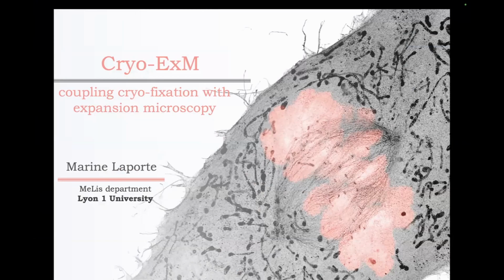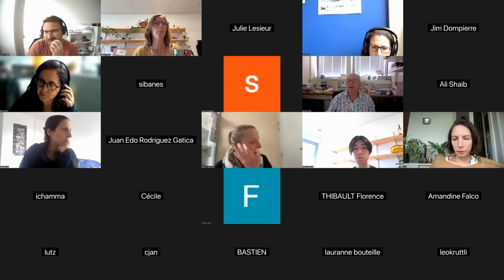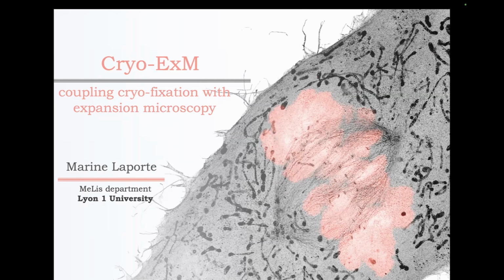So today I will present to you, most of what I'm going to present is already published. It's more on the application of this cryofixation coupled to expansion microscopy. So I will go through some technical specifications and also some applications that could be useful for all of you. It's kind of a catalog of what is feasible by coupling expansion to cryofixation.